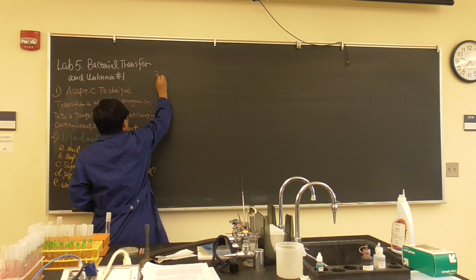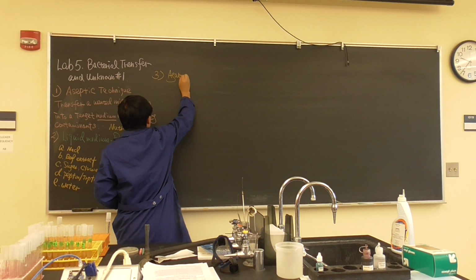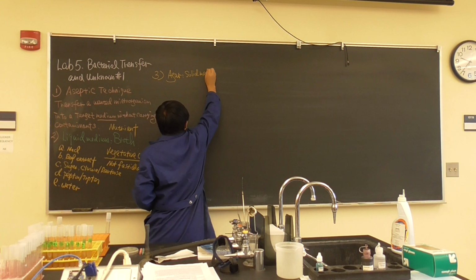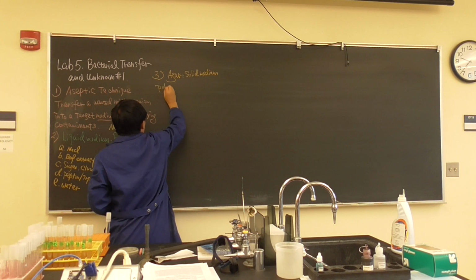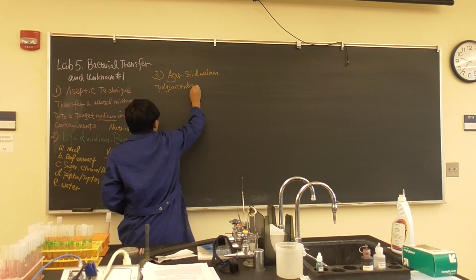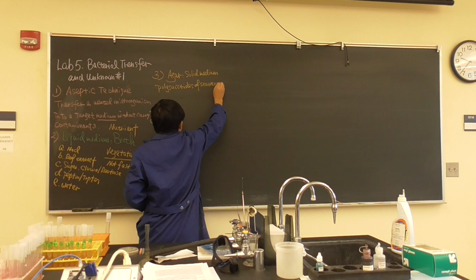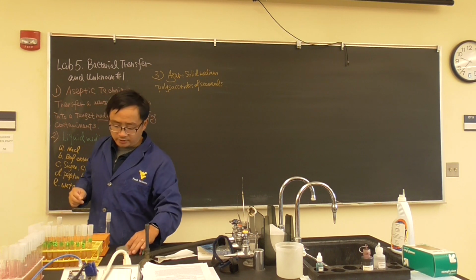The third thing we want to mention is agar. Agar is a solid medium made from the polysaccharides of seaweeds, which we already talked about in the lecture.